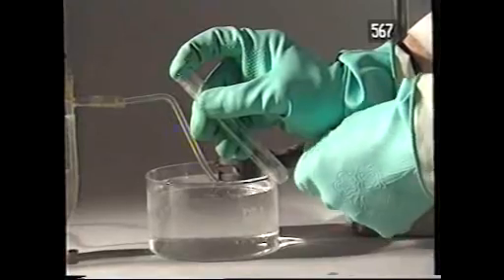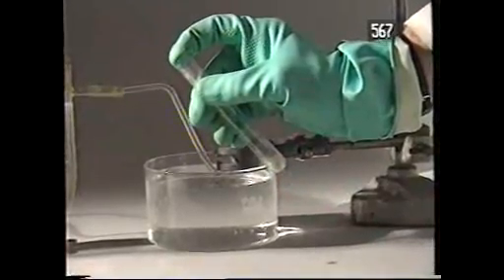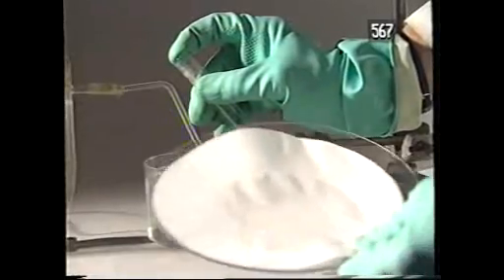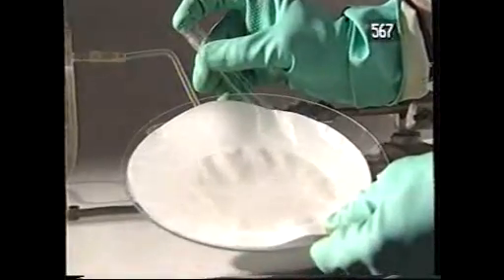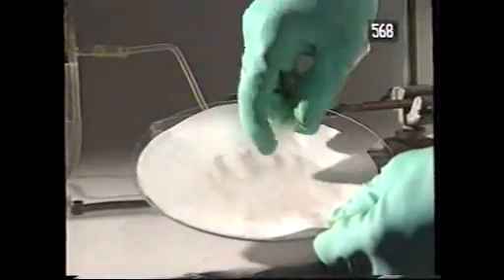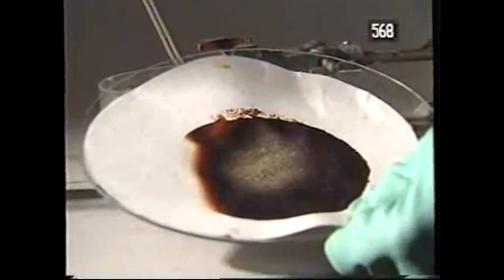Now I'll show you a test reaction for chlorine. I've removed the chlorine tube now. Chlorine has a characteristic reaction with potassium iodide solution. I've put some onto this filter paper and I'll dump the chlorine onto it. A brown deposit of iodine is formed.